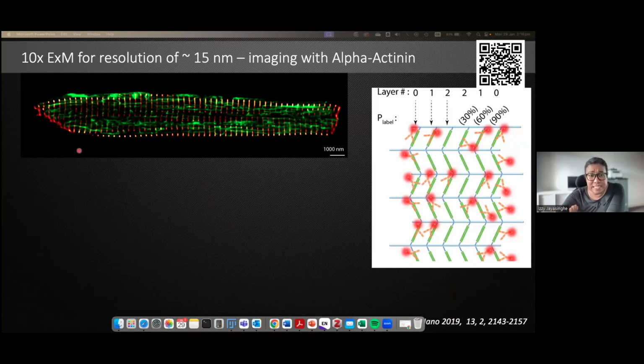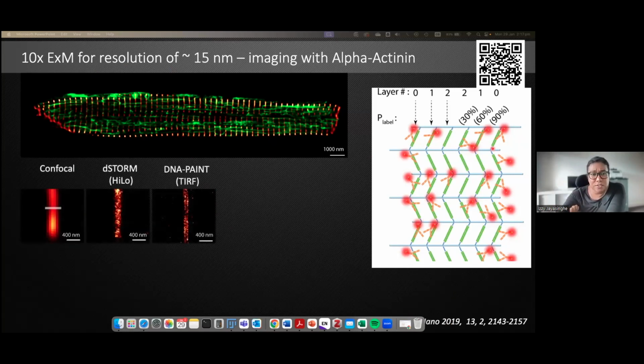We were interested in these banded structures called, in muscle, Z-lines, and they're often a lattice, a 6-fold lattice, where each band is occupied by a protein called alpha-actinin. We can antibody label them and image them with different modalities, and it's essentially a very nice intrinsic ruler.